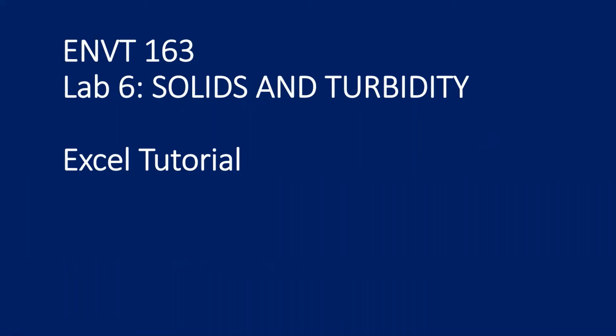All right, hello students. So what I have here is a video that's going to go through the steps required to do the data analysis using Microsoft Excel for Lab 6, Solids and Turbidity. You can pause the video at any time to take a look at what I'm doing for each of the steps. Let's get right into it.